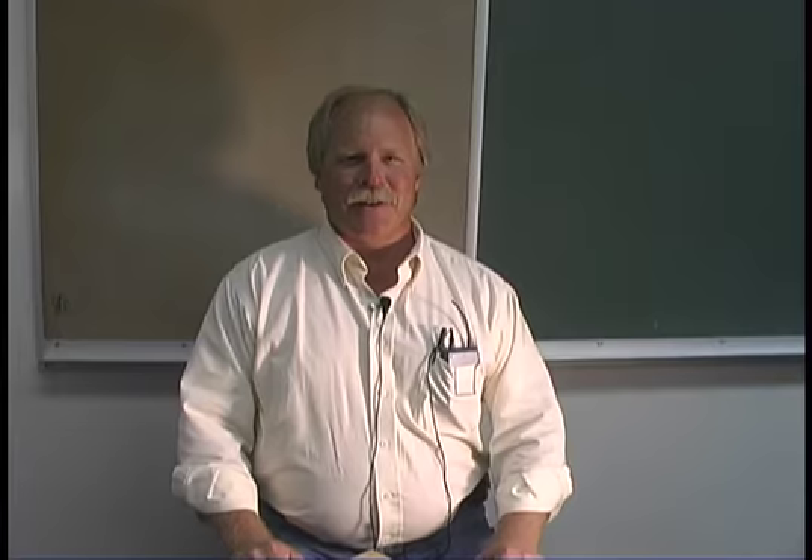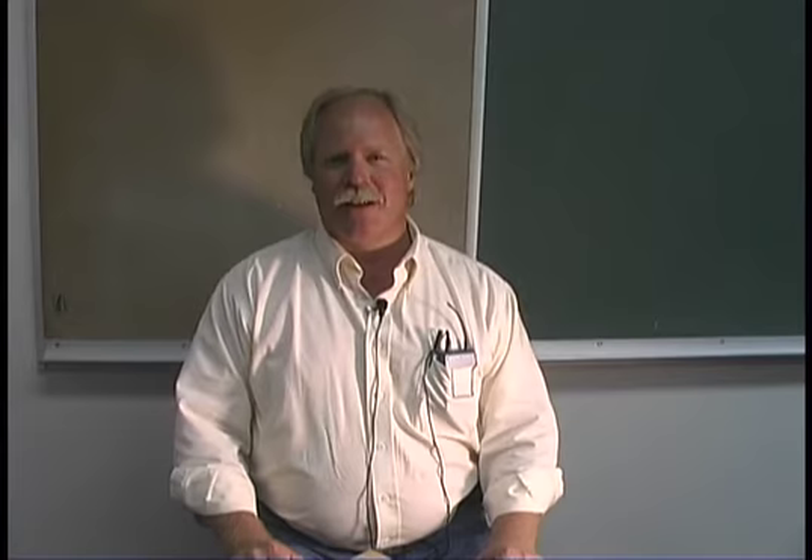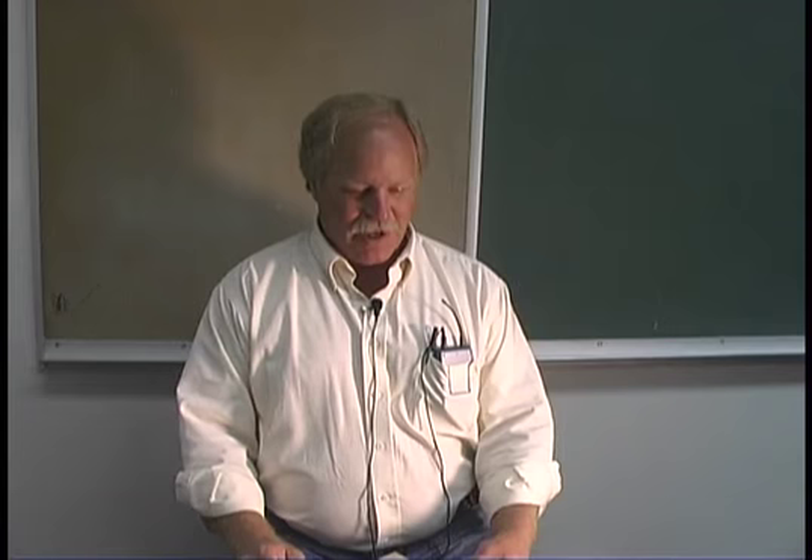My name is Mark Maggi and I am the District 6 Entomology Specialist from Fort Stockton. Today I'm going to demonstrate how to properly mount Lepidoptera. To get started, the first thing you need to do is have a proper spreading board.